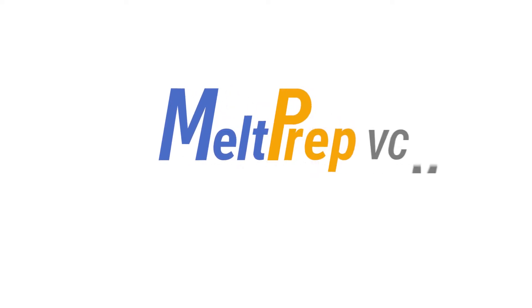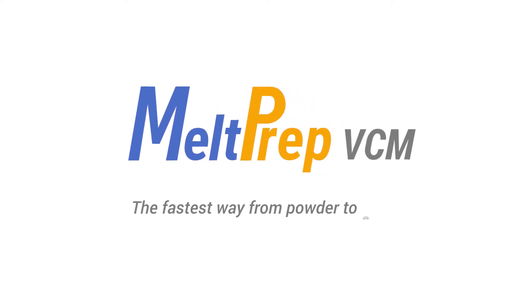Welcome to Meltprep vacuum compression molding. The fastest way from powder to sample.